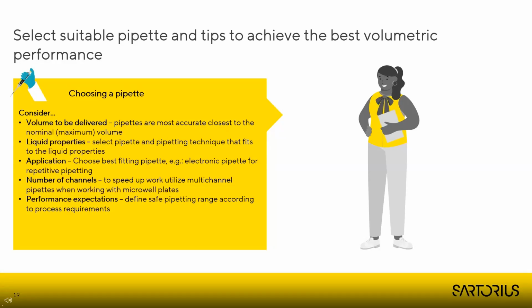However, there are a couple of things, I would say two major contributors, on how pipetting practices can have an impact towards a more sustainable lab. First one is think ahead. So pipetting in a smart way that utilizes the consumables, which are typically plastic, and reagents in a smart manner. So plan ahead and, for example, do multi-dispensing and utilize one consumable to fill the plate if possible.